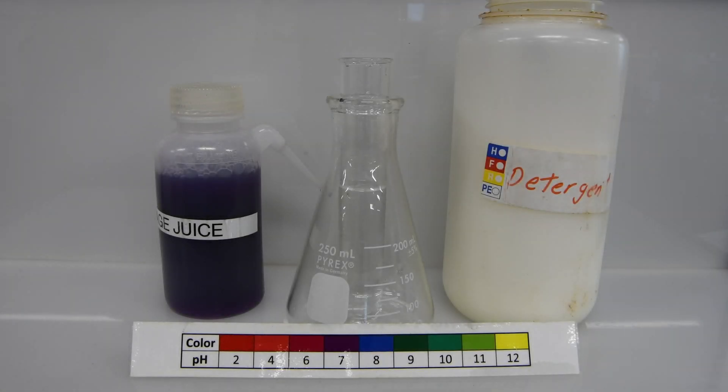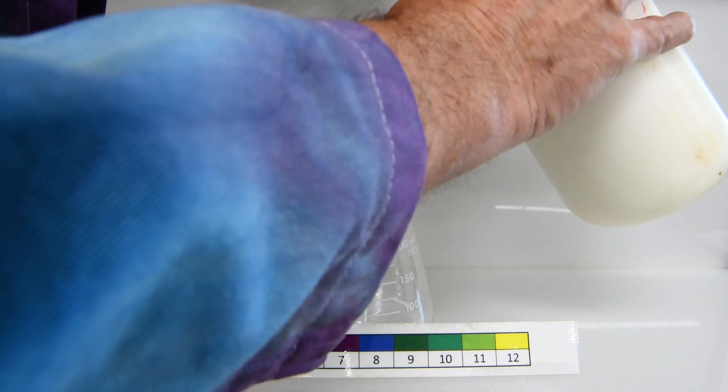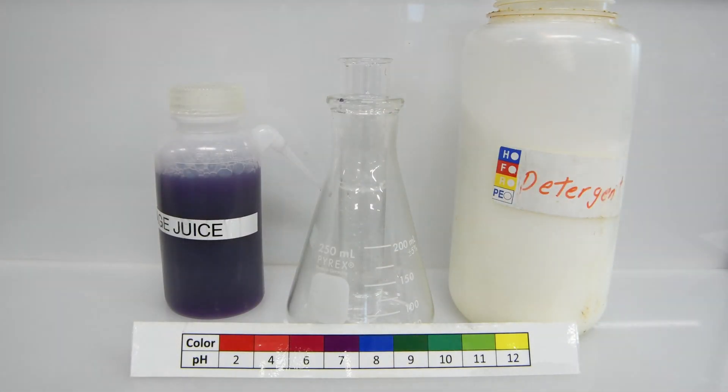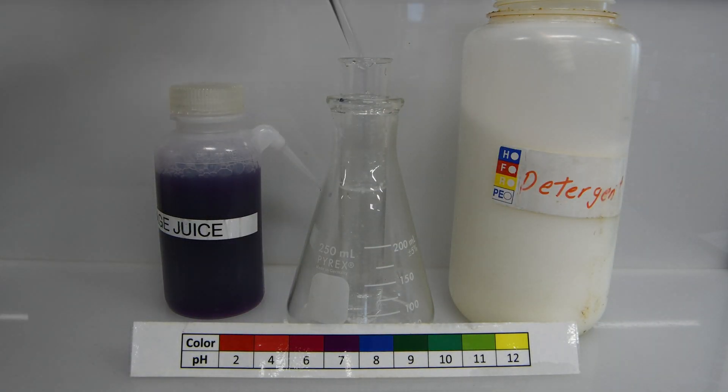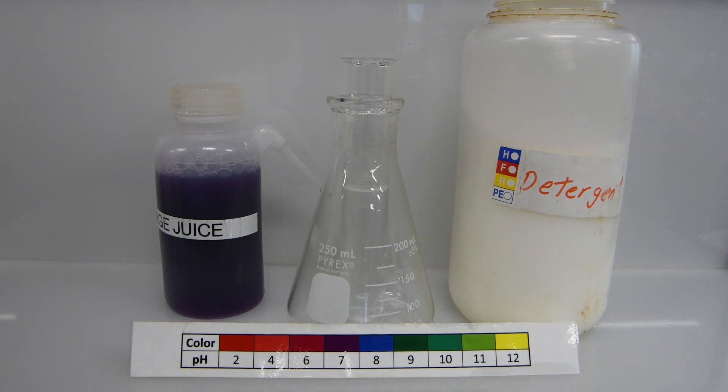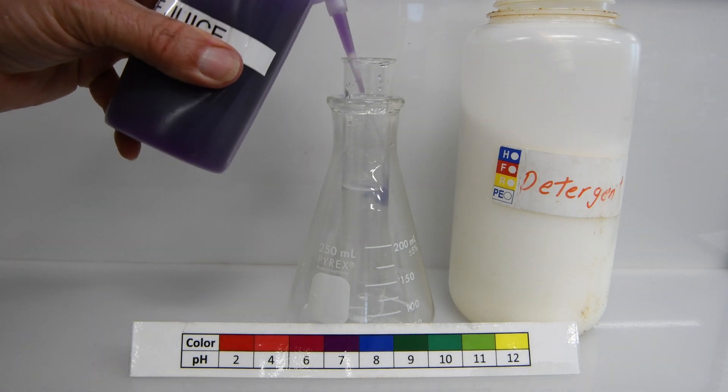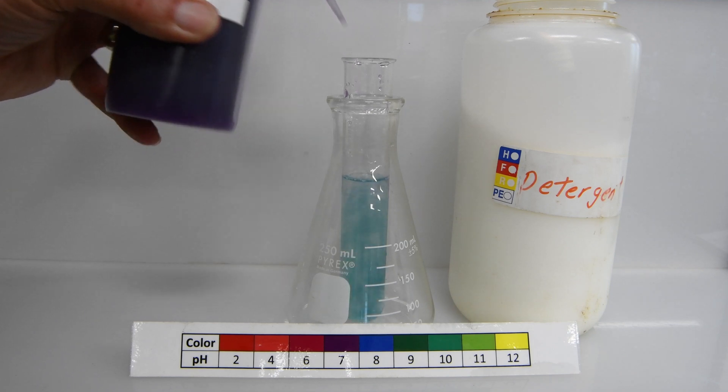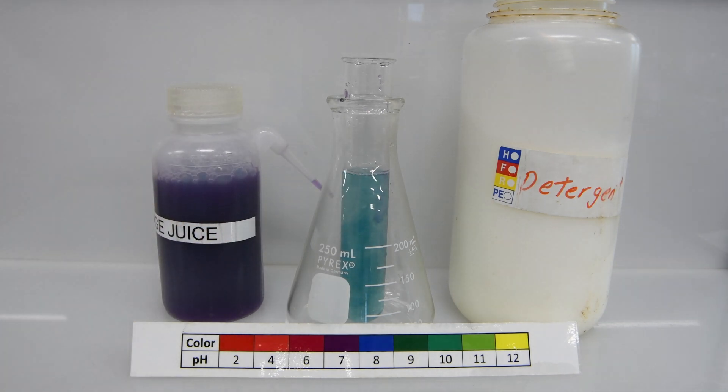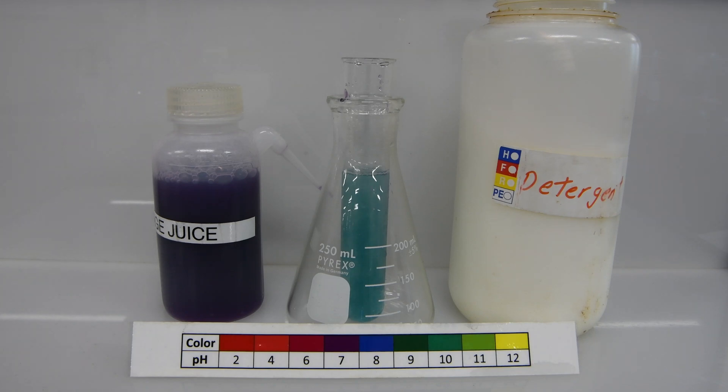We're going to wrap up our cabbage juice tests with some laundry detergent. So we'll add our usual small amount. And go ahead and stir that to get it dissolved. And now we add the cabbage juice. And we get a very lovely sort of teal green color. So that wraps up all of our cabbage juice tests. Now we're going to move on and work with the pH meter.